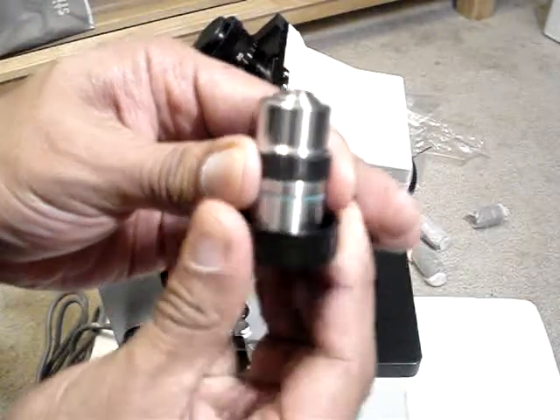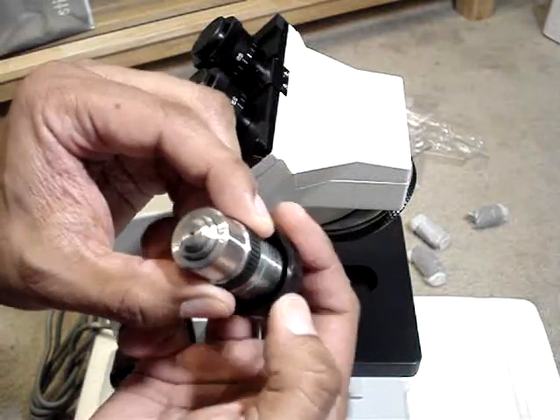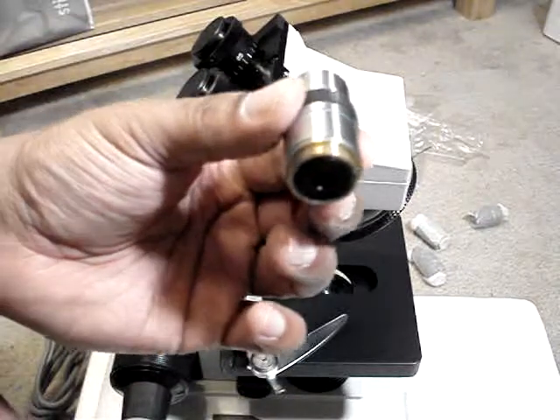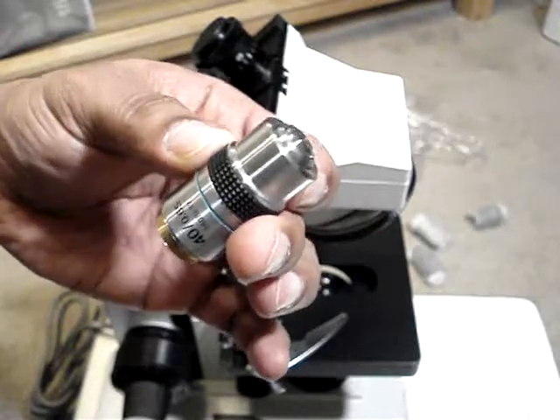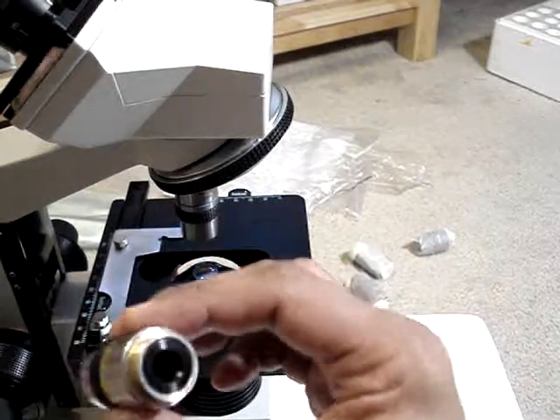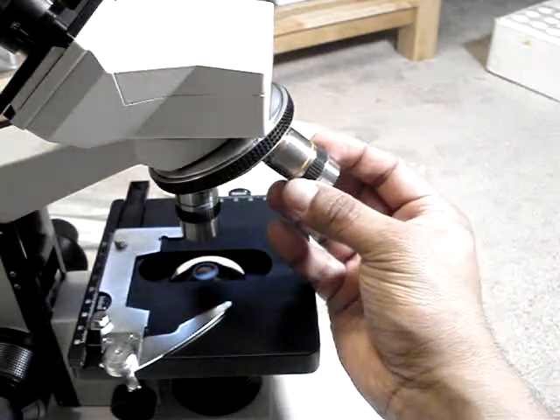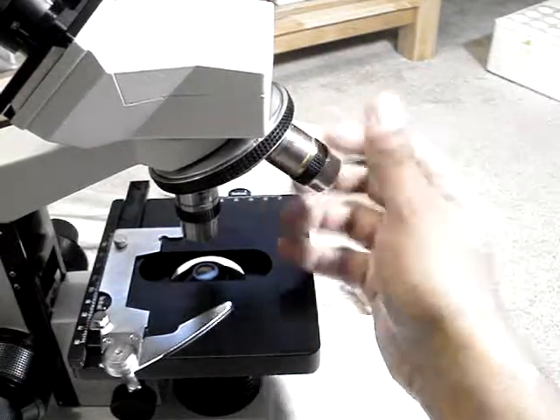This particular microscope is made by Celestron and the model number is 4060. It has an optical head with a 45-degree incline binocular headpiece which is 360-degree rotatable. It also has a built-in electric illuminator with a halogen bulb, a 110-volt power supply, and quadruple nose pieces.